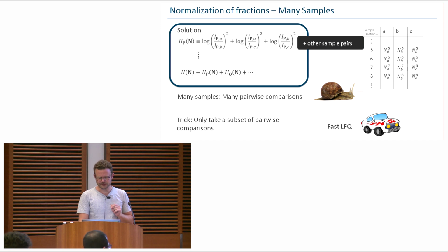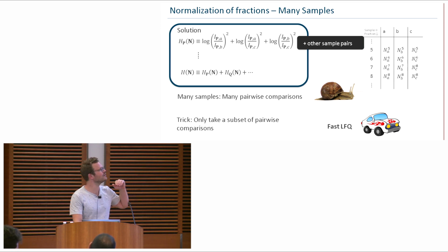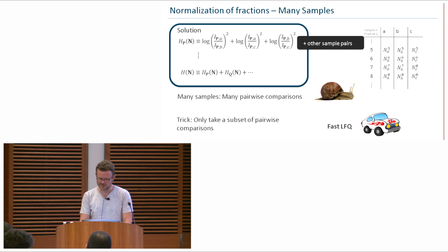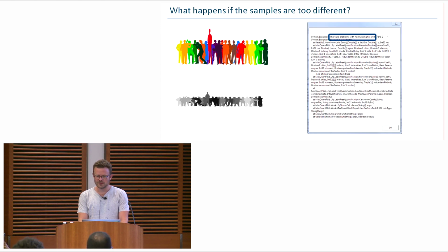Okay. I think now we're at a point where we could compare not two samples, but thousands of samples with fractionation. So there can also be a problem.